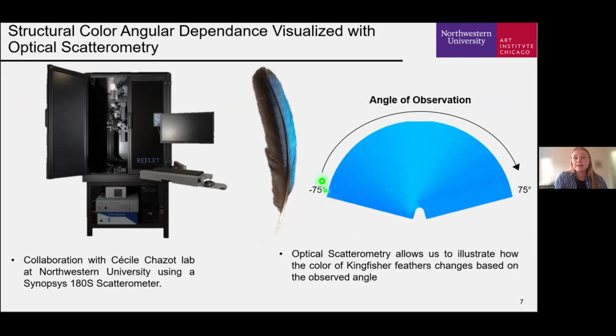Doing these measurements on reference kingfisher samples, this color chart visualizes the observed color of the feather in the blue region as a function of angle, so the different hues and variations of the color you would see if you tilted the sample. To achieve this visual representation, we took the spectra from the optical scatterometry, converted it to RGB color space, and plotted it at the corresponding angle.